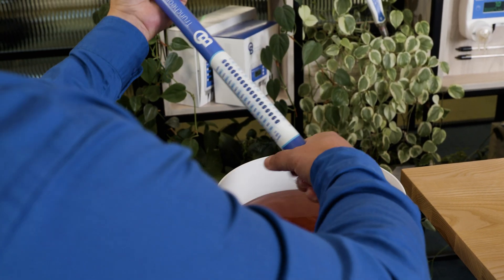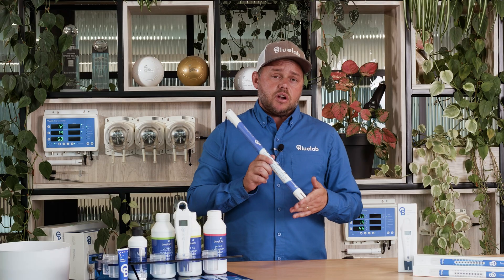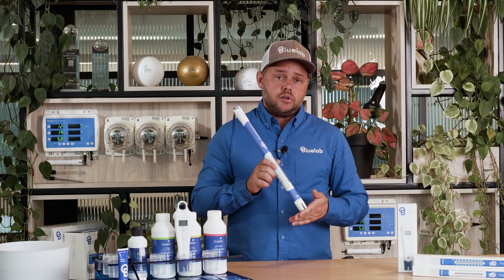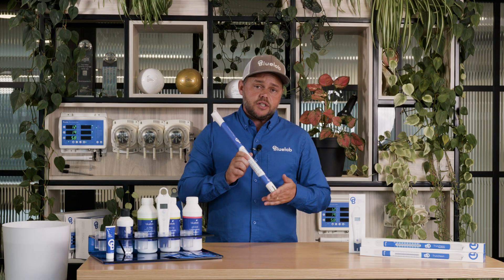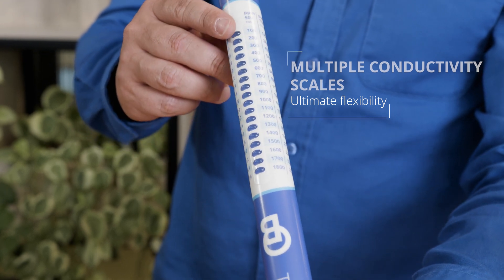Built tough and simple to use, the Bluelab Truncheon is virtually indestructible. It requires no calibration and a very simple rinse after each use. The product is fully waterproof and comes with a five-year warranty. Choose from multiple conductivity scales for ultimate flexibility.